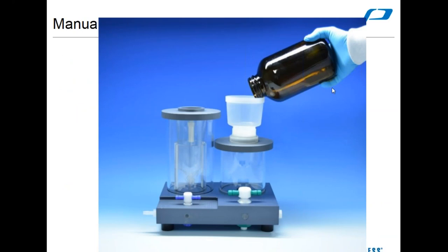All right, so the first question, where would the collection flask go? Let me back up to that picture. The collection flask goes inside this outer sheath. There's an inner sheath there to hold the StableWave vessel in place. That also can be taken out. You can either put a pan in here or a glass flask in here. The sodium sulfate cartridge kind of helps you align—it's dead center. With most of the flasks we've used, that cartridge actually goes right down inside the opening of the flask. So you'll know for sure you've got it lined up right.